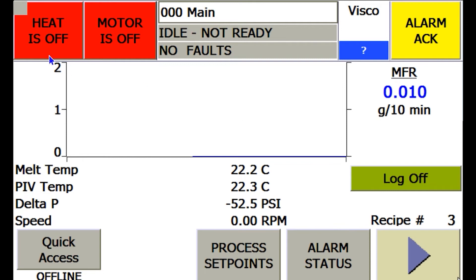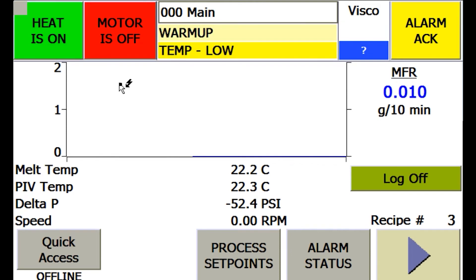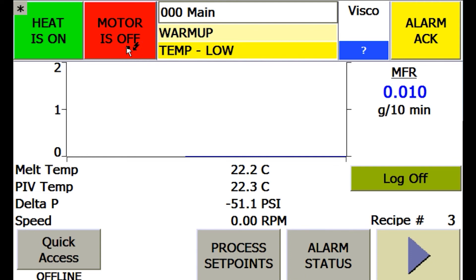Up in the top left, there is a heat on and off and motor on and off. These are simply pressed to enable or disable. The motor cannot be turned on and will not go green until the system is in a ready state shown here.